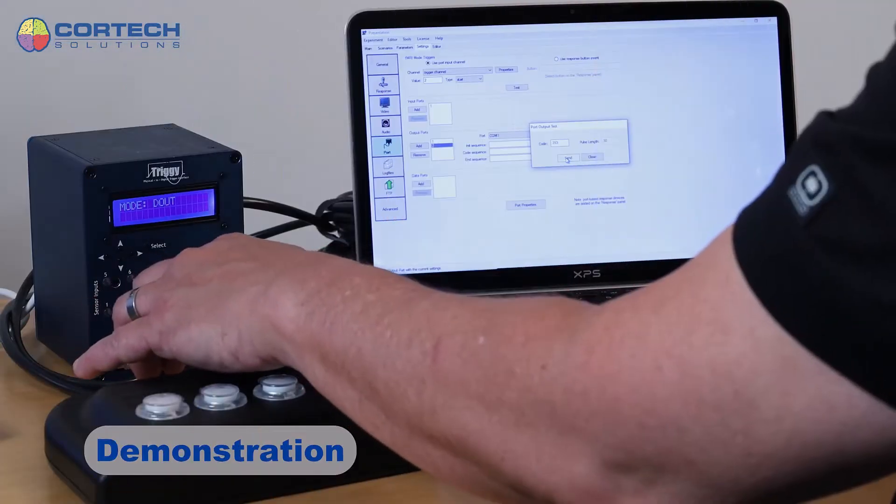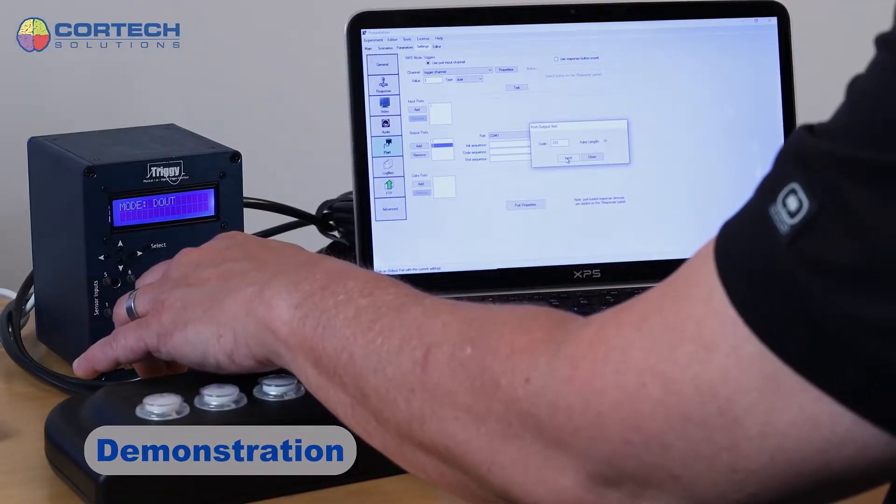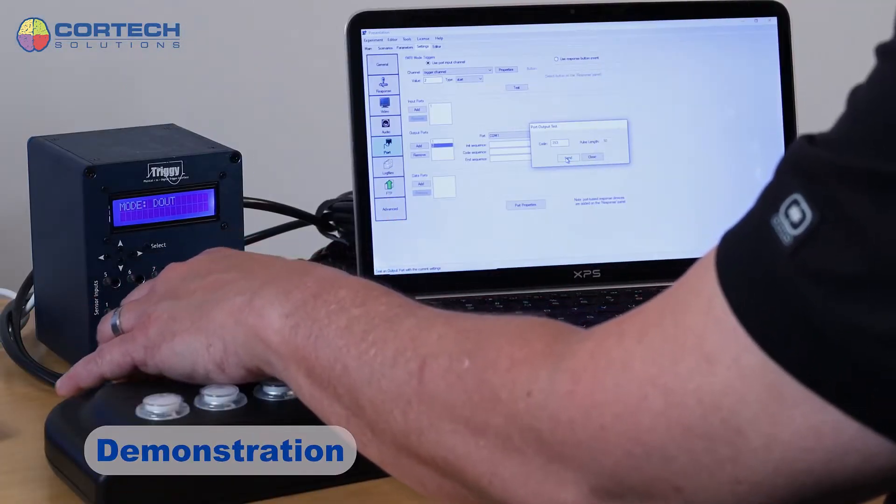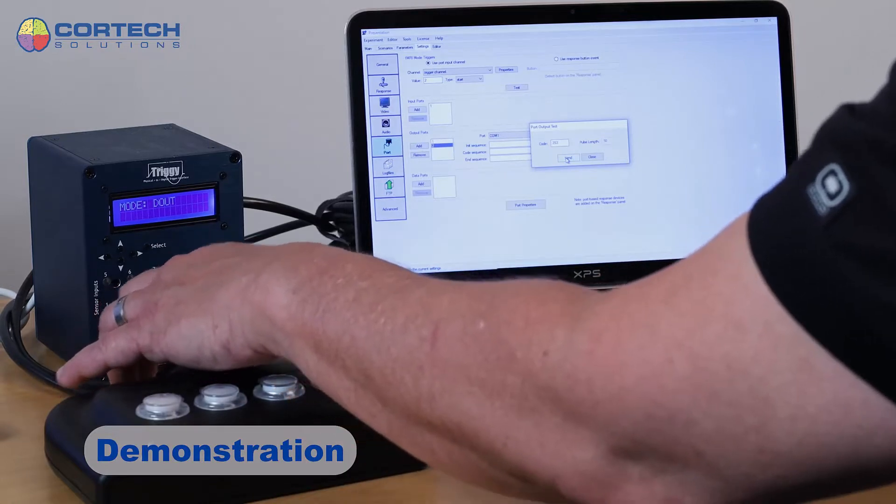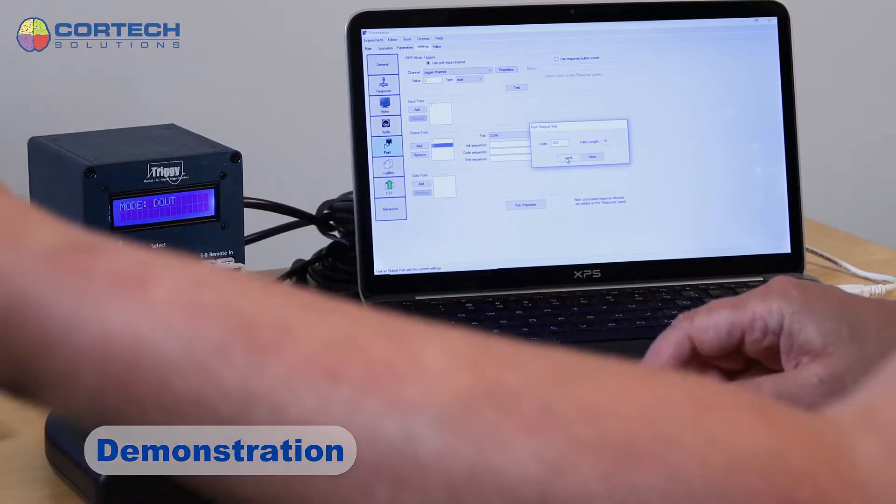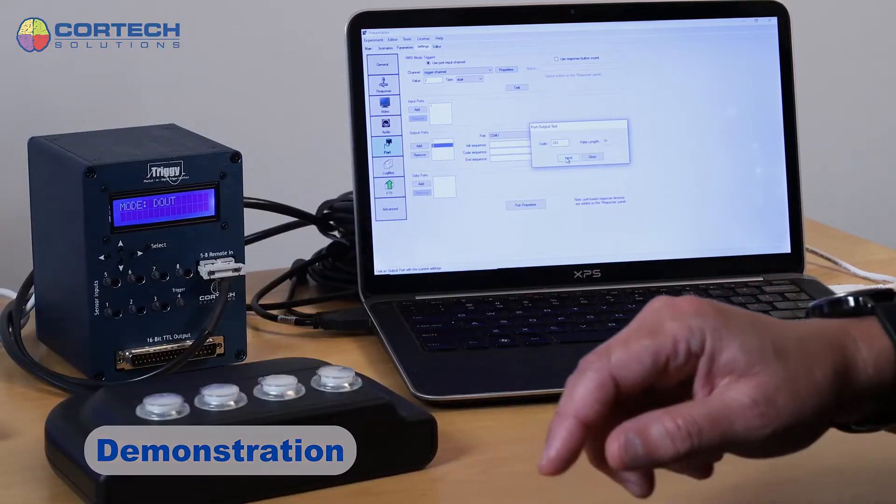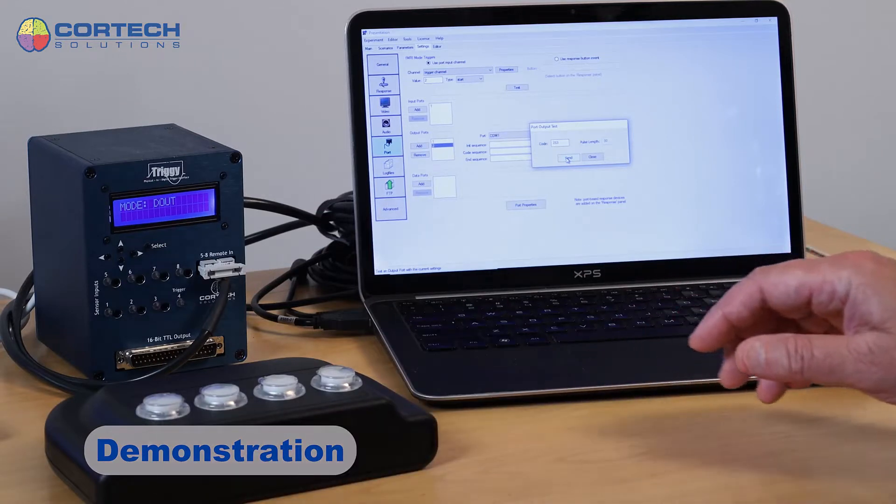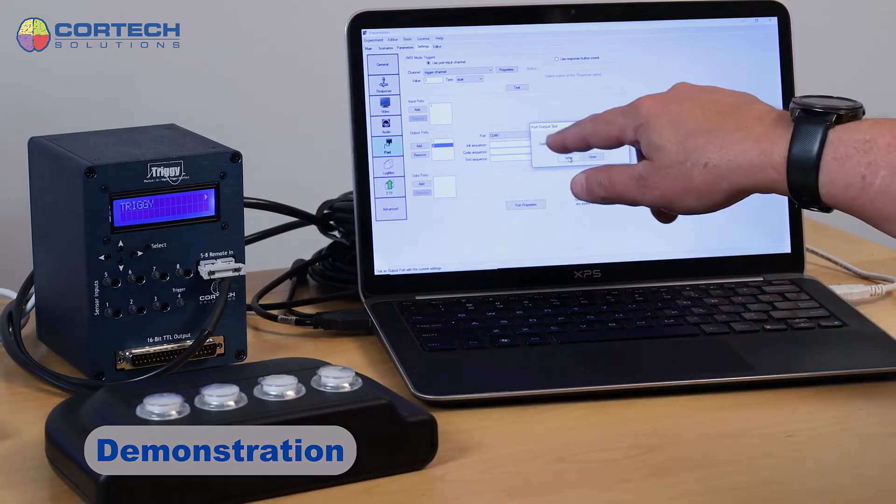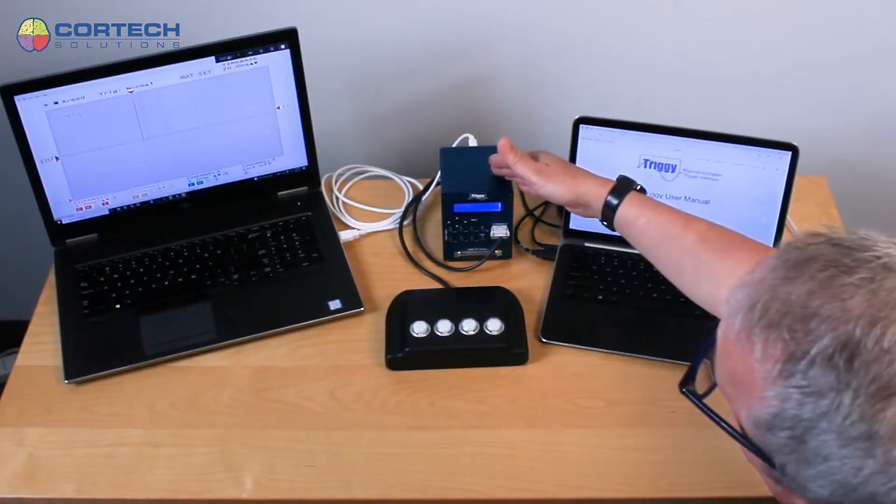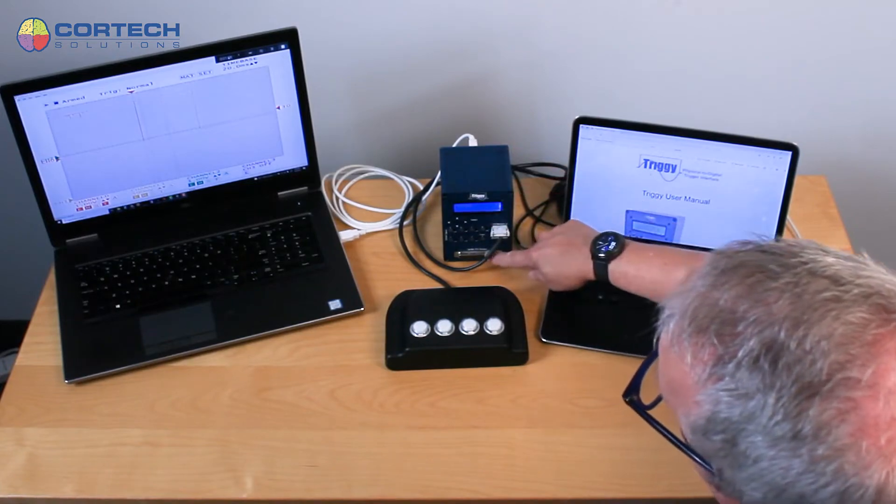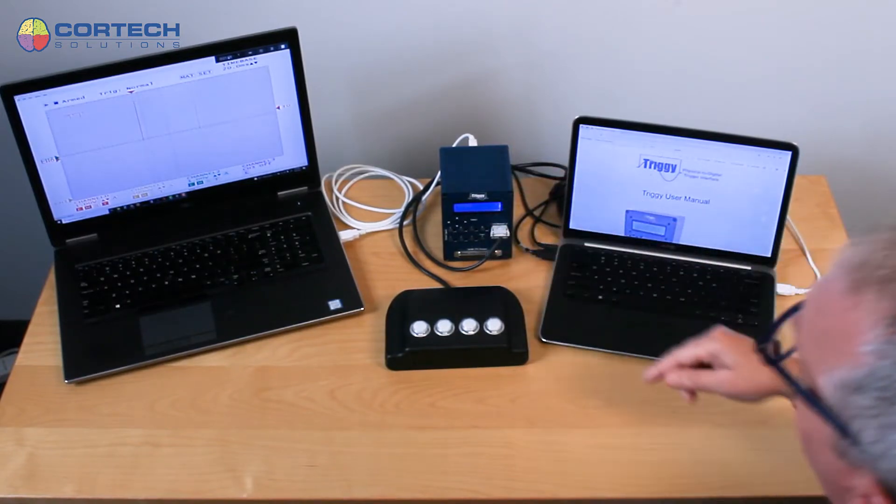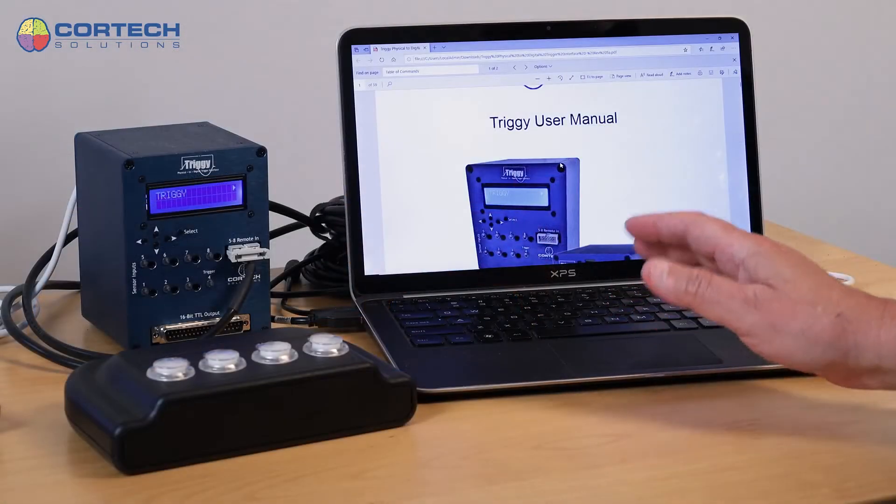That's one way you can use that direction from the computer to the device to send a port code that you want to send, let's say, from your stimulus or experimental control software to Triggy and then out its TTL output port.